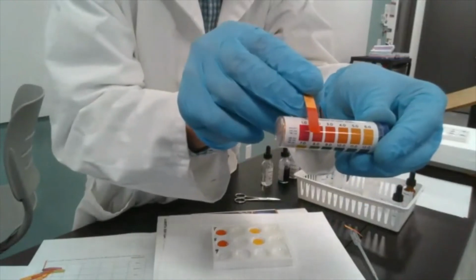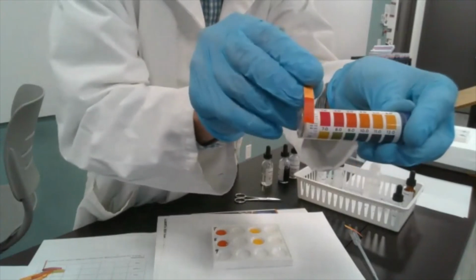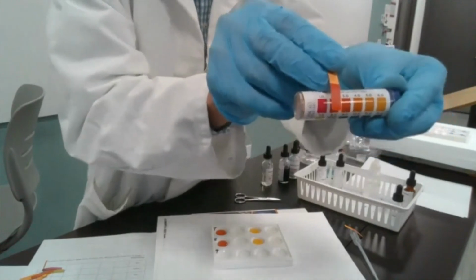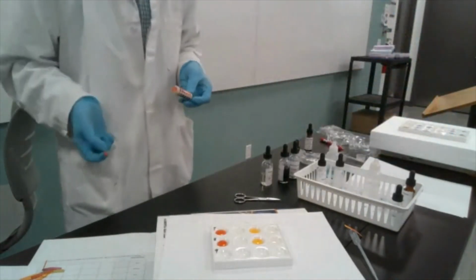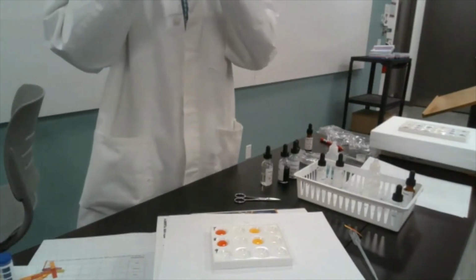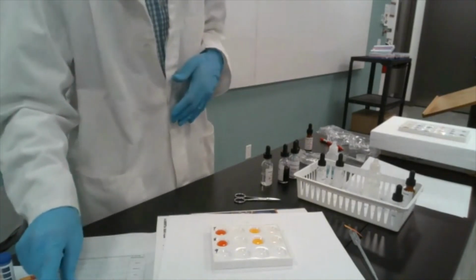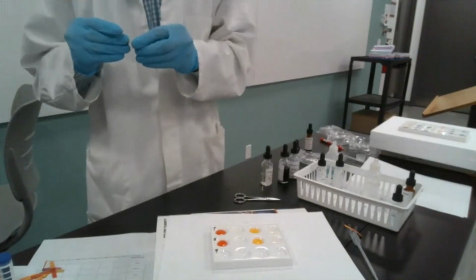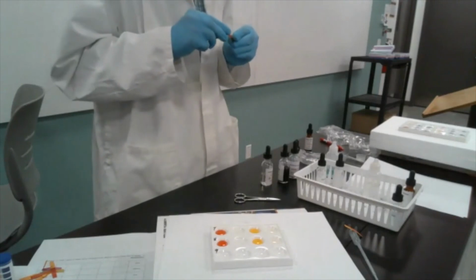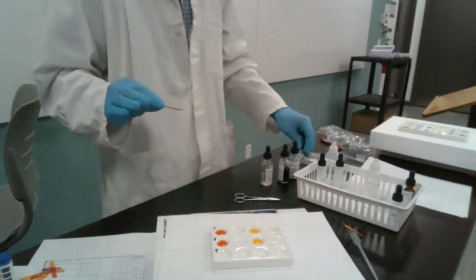It's maybe closer to 2, but I think this is still 3. Yeah, I'd say this is still pH 3 because 2 is definitely too red for this. So pH 3, vinegar. And we got the same result for pop. Of course, it depends on the concentration sometimes and so on, but it just tells you that in the chemical nature of pop and vinegar and grapefruit juice, there's something in those 3 that is similar and causes the indicators to respond in the same way.